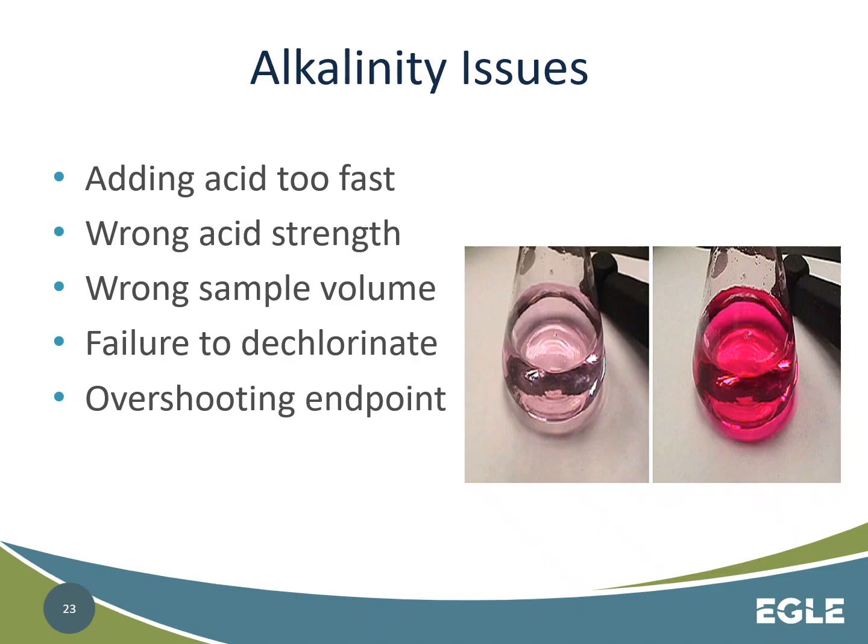It might be failure to dechlorinate because chlorine can interfere with the reaction of the titrant. And then overshooting the endpoint. Well, overshooting the endpoint occurs by adding acid too fast. So that's very typical.